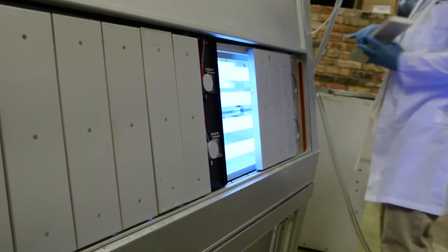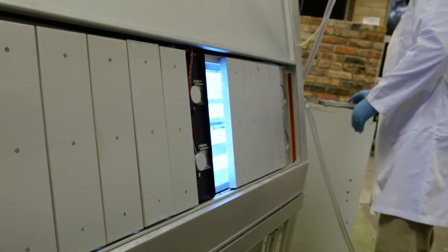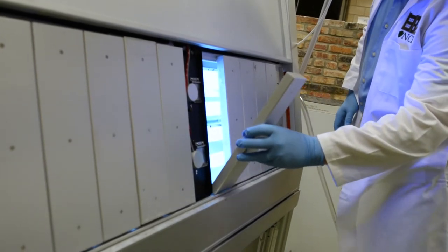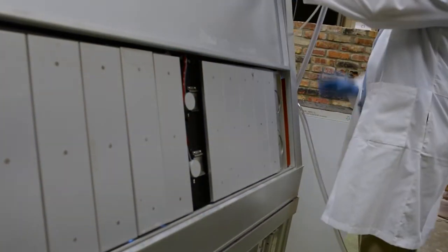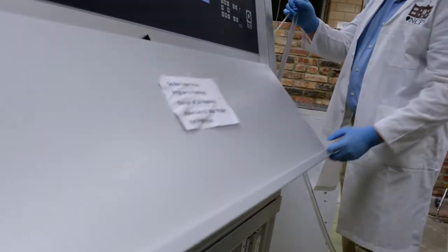We have UVA or UVB bulbs, depending on if we're wanting to see how samples would weather inside a structure — inside a building with harsh lighting — or outside related to sunlight. What we have in here now are bulbs that simulate sunlight.